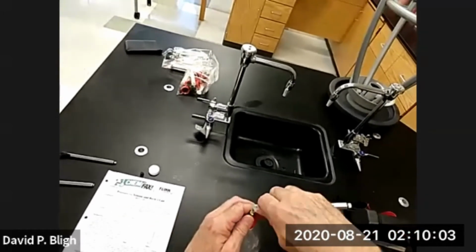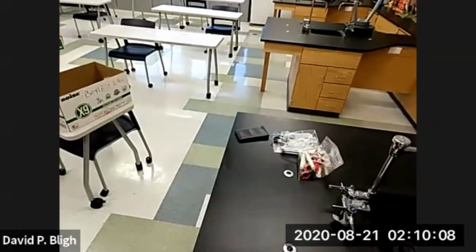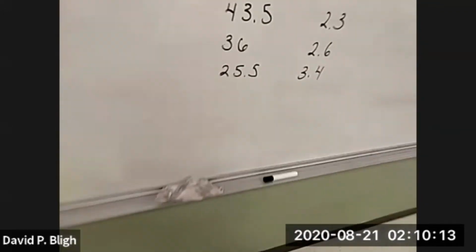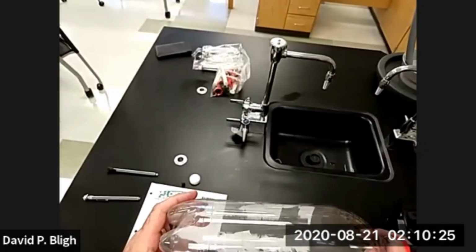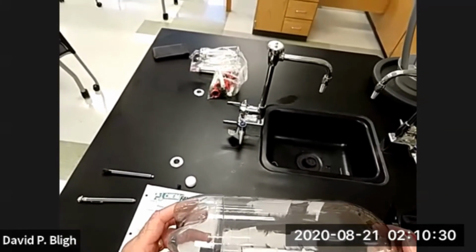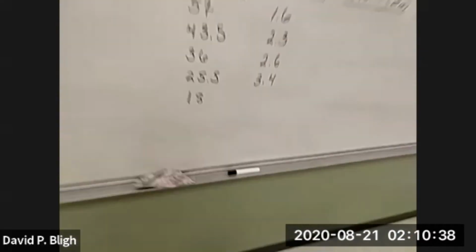And take the pressure measurement. All right, now we have 15, 16, 17, 18 on the money. 18 psi. Okay, and what volume do we have? Okay, 4.3 milliliters.